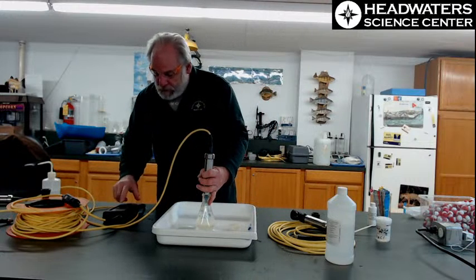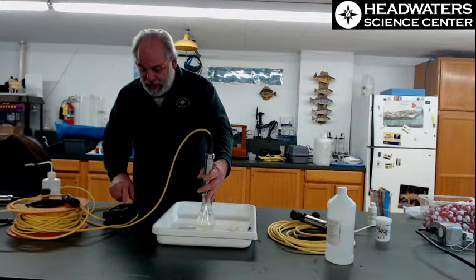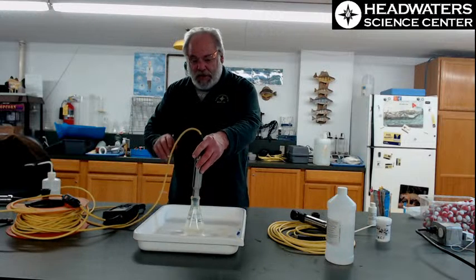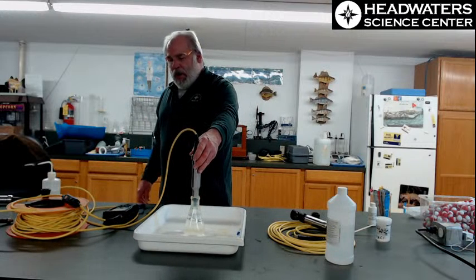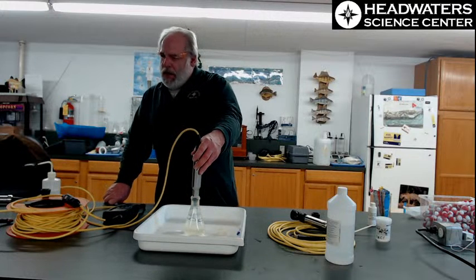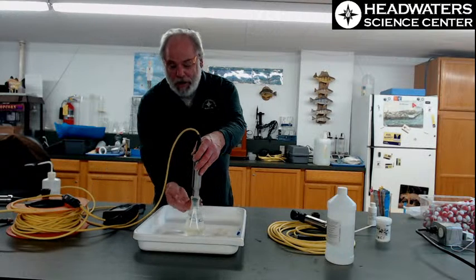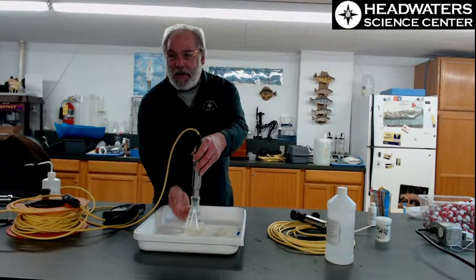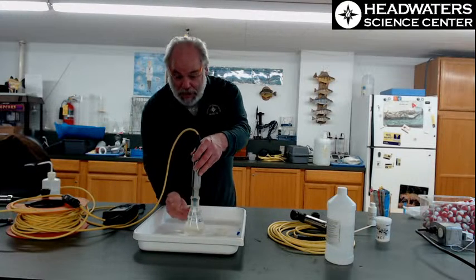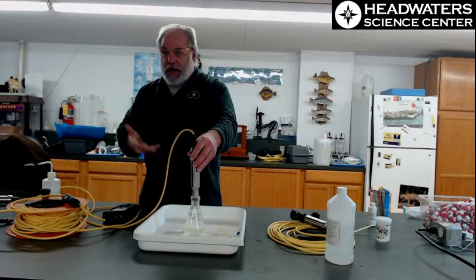Now, again, I don't read this one first, though. This is the only one I don't. I'm going to go right to calibration, and this actually takes a little while. And now we have a little time to talk about the question in your mind, and you should have that turned head look and go, yeah, but if I look closely, I see you're not in the liquid. Well, the water isn't 100% saturated with dissolved oxygen, which is what I'm calibrating to, but the air is, because it's the air that has to saturate.